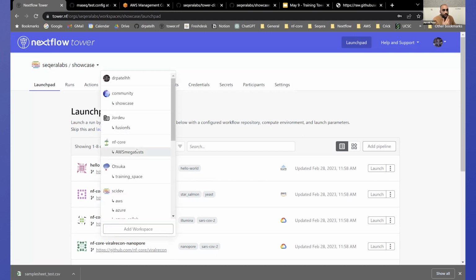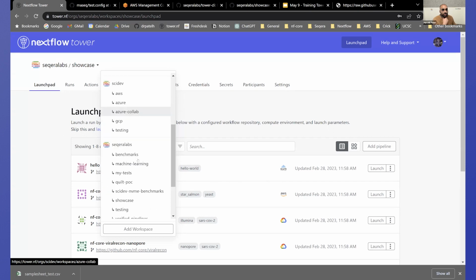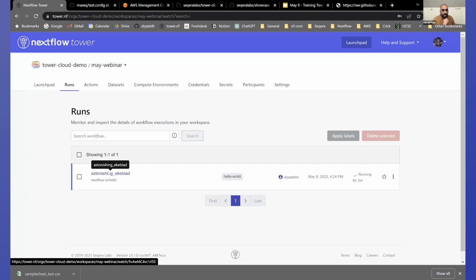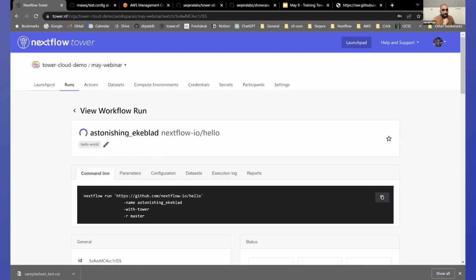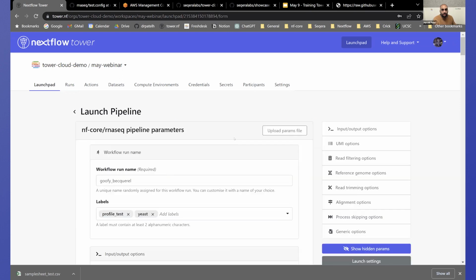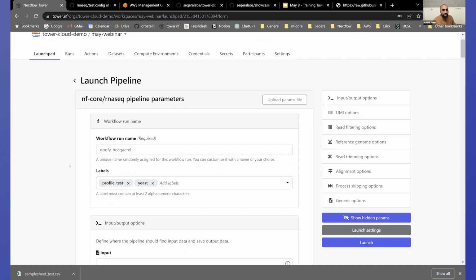And that's owing partly to the testament of Nextflow, and also now Tower is following in sort of the same vein. So now I'm going to go back to our workspace that we've created. Hopefully there's some progress. There isn't. Okay, let's trigger RNA-seq anyway. So I'm going to launch this pipeline, which is the NF-Core RNA-seq. So you just click on launch from the launchpad.